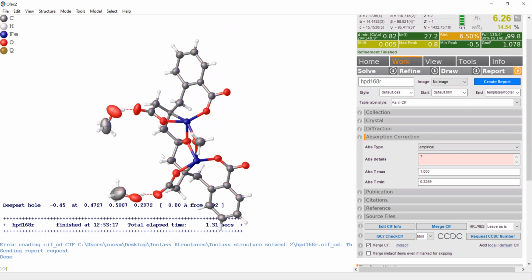And if you look at it chemically, does it make sense? For an atom to bind to an iron ion, it needs a lone pair of electrons. And a 3-coordinate carbon atom, to be honest, chemically, that doesn't exist. So you can't just have a 3-coordinate carbon atom and expect that to bond to an iron. If it needs to be sp3, it should have a hydrogen. So this would tell us it's not carbon, but something very close to carbon that would have a lone pair of electrons, a nitrogen. So let's switch these to nitrogens. And that makes better sense chemically because now nitrogen has a lone pair when it's 3-coordinate, and that can interact with the iron.